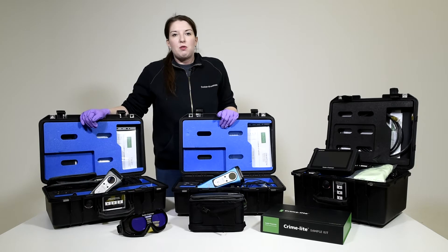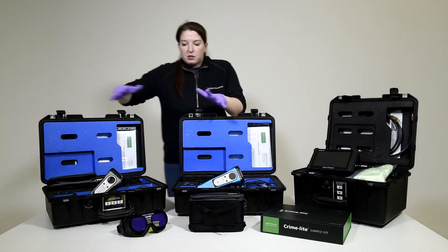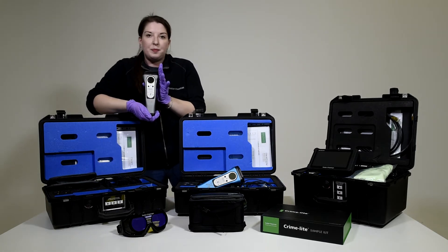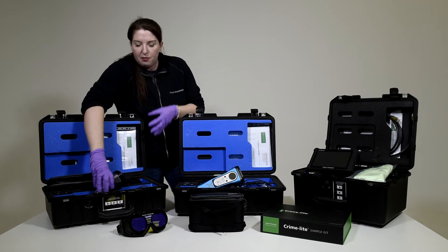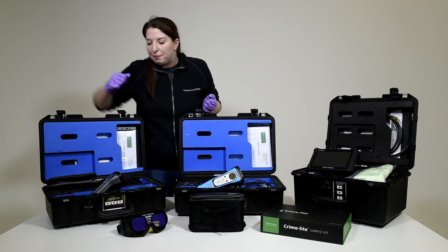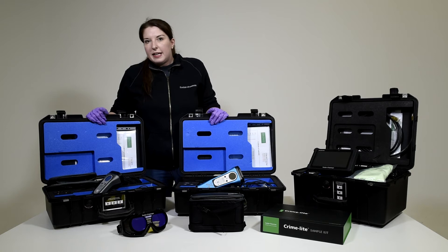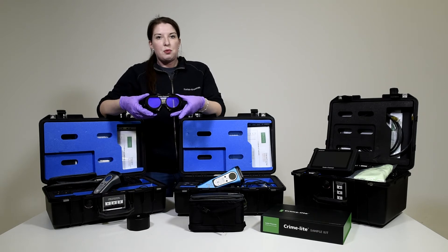Now we're going to look at some of the Crimelight sources that may be useful in your mobile laboratory setting. First, we've got our Crimelight Xs. We have two versions: the X10, which provides you with 10 different wavelengths of light. It's important to have a range of light sources to find a range of different evidence types at your crime scene. We have visible light sources and the ability to create fluorescence as well.